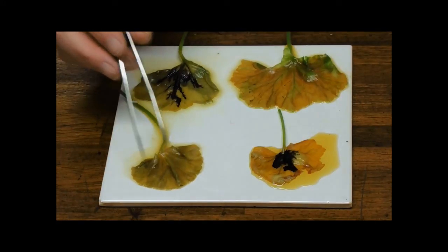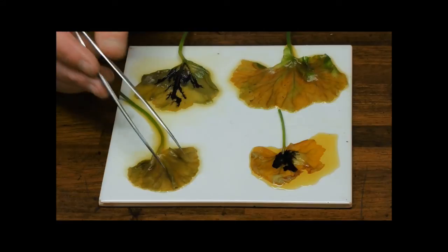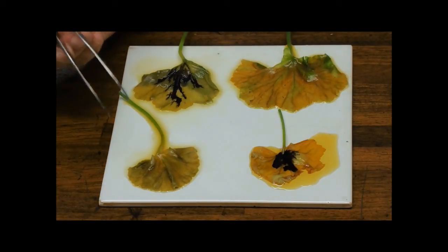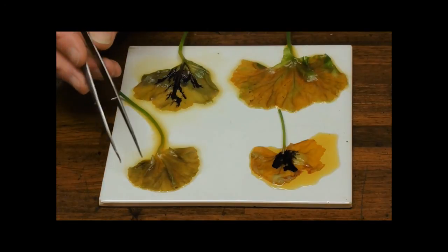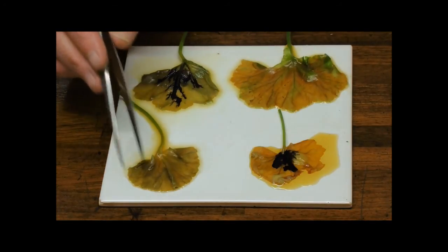This is, I'm thinking this might be slightly less convincing on the basis that it seems to have made a little bit of starch. And it might just be that it's not been in that bell jar for long enough. And so we've got little bits of black here, but most of it is just brown.